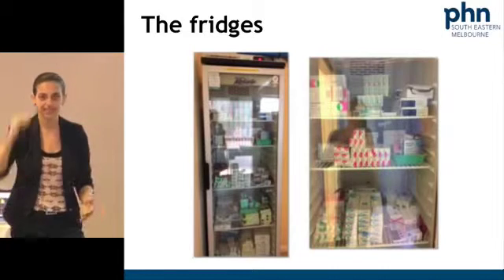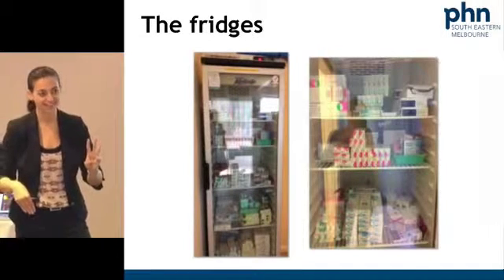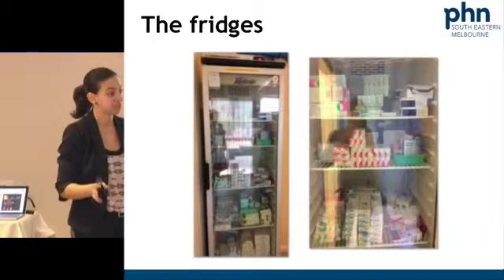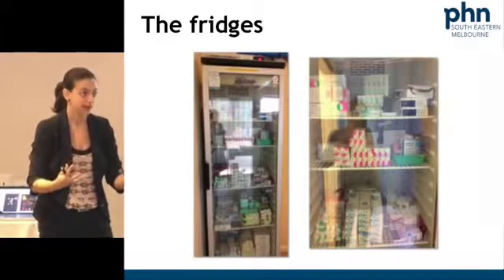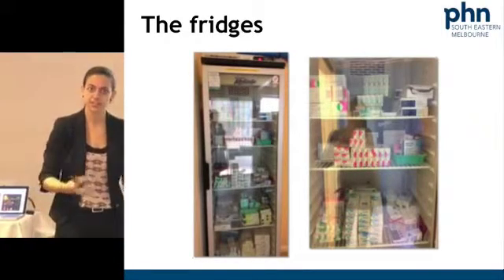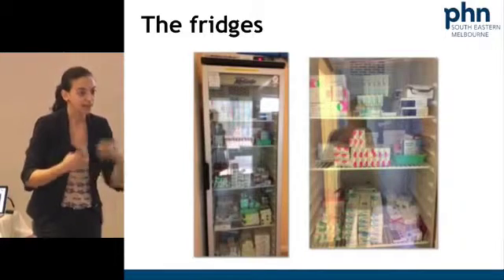There's no issue. There's less than 1 degree of difference between the shelves. I get a third call from another practice. We need to know what this guy's name is. So it's the company. And so these are all practices in this area that have had the same setup. Now this other practice calls me and they're really concerned. They're saying, this is happening, not quite sure. I was really upset.